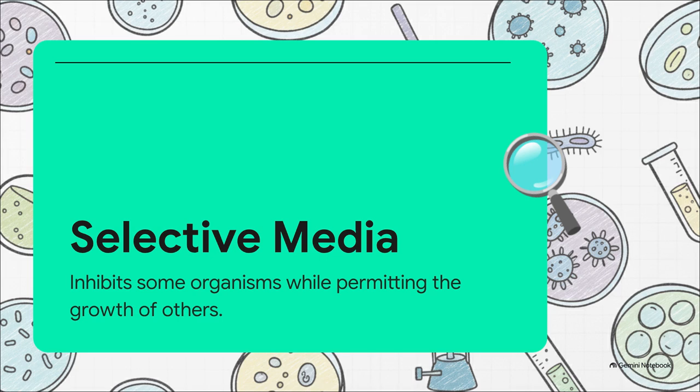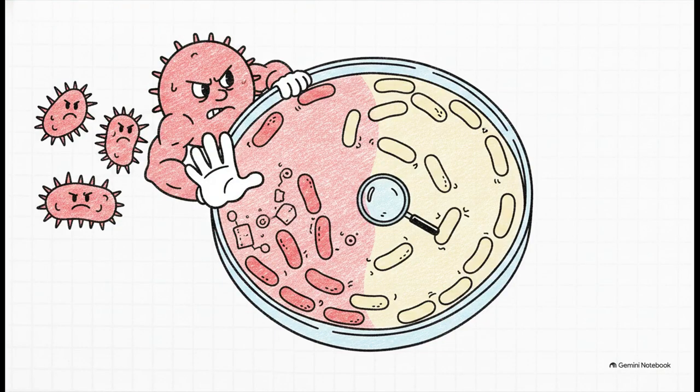They allow different organisms to grow side by side, but visually distinguish them based on observable biochemical reactions, which is almost always a very obvious color change. And the undisputed king of this interrogation room is MacConkey agar. It's one of the most critical tools in clinical microbiology because it performs two interrogation jobs at the exact same time. It's both selective and differential.